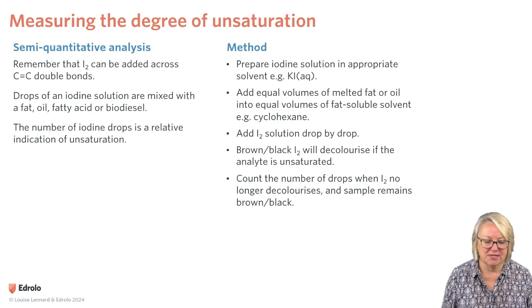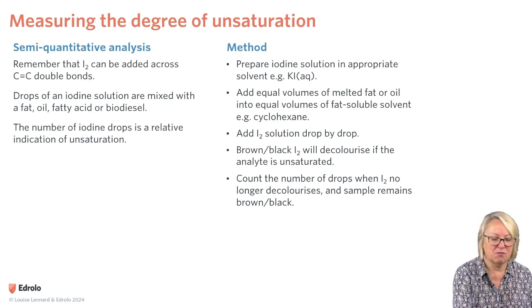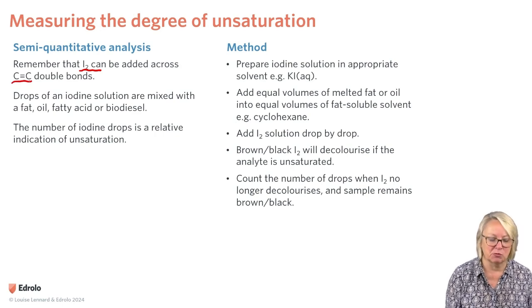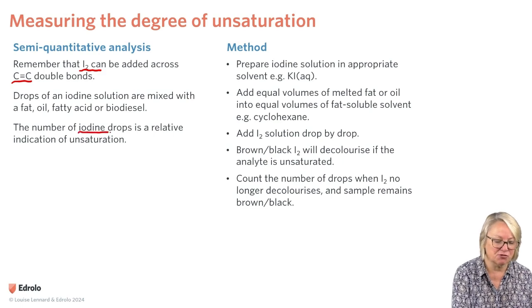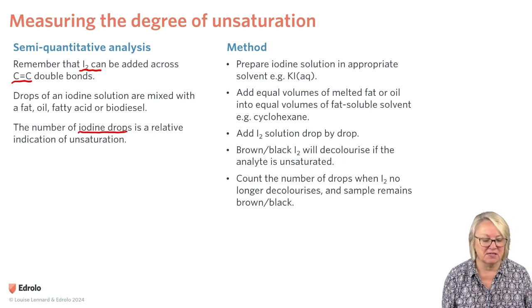It's a semi-quantitative analysis, and remember that iodine can be added across carbon-to-carbon double bonds. So drops of an iodine solution are mixed with a fat, oil, fatty acid, or biodiesel, and the number of iodine drops is a relative indication of unsaturation.